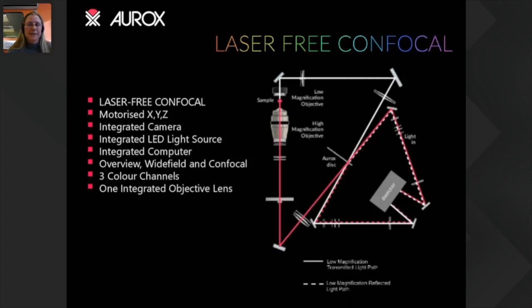Another quick question: are the channels acquired sequentially? Yes, they are acquired sequentially. What we do is strobe the LEDs very fast. If you come to the live demonstration tomorrow evening, I'll be able to show you how fast that is happening. You almost get a pseudo real-time 3-color image, so it's very, very quick.